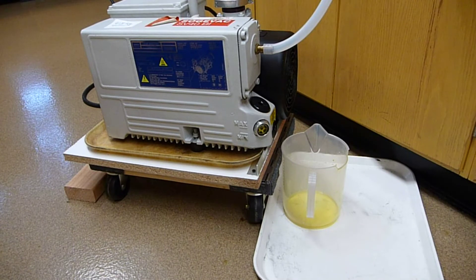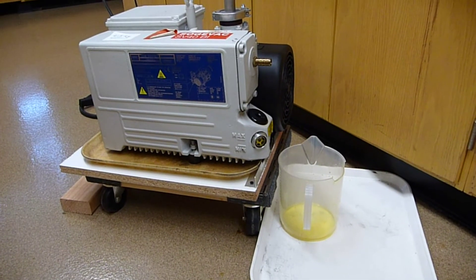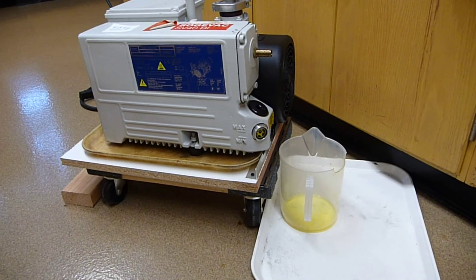The pump is still running and what I'm going to do is turn off the pump, elevate the piece of wood, and drain the oil out. Let's turn off the pump. The pump is now turned off and unplugged, and the exhaust hose is disconnected.